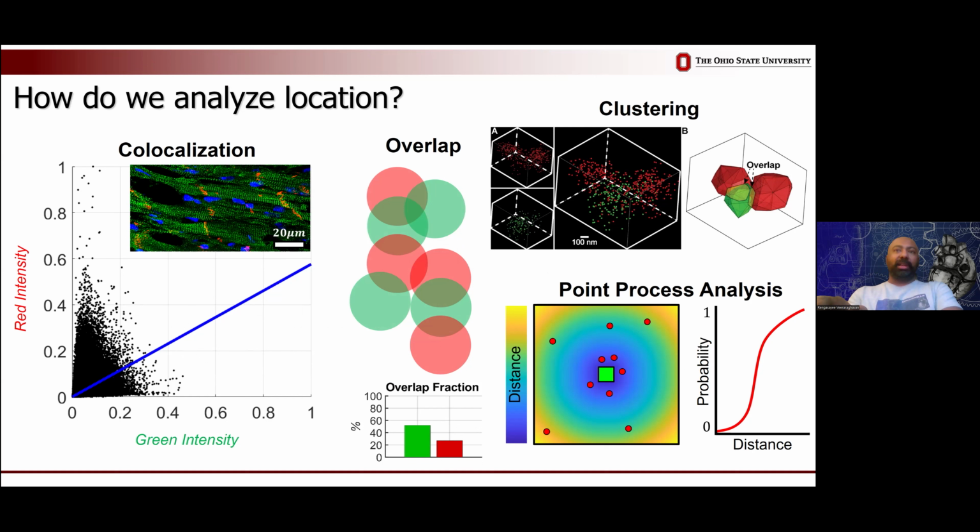And as our microscopes get better, these methods start to let us down in places where we want to be careful. There are other methods. If you're in continuous space where your space is not broken up into pixels or voxels, you can do things like cluster analyses, which we'll talk about briefly in a bit.